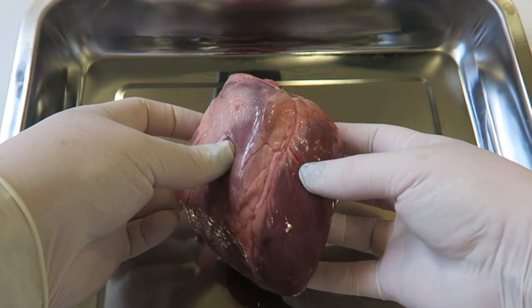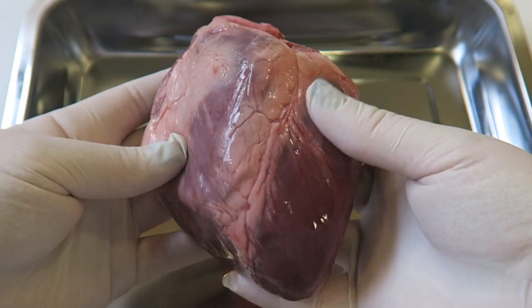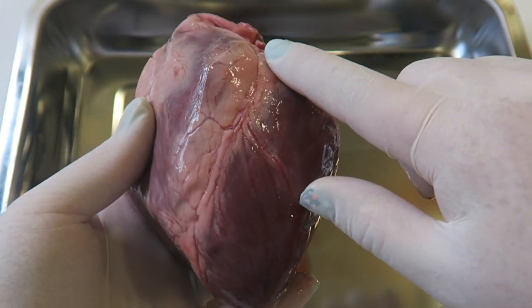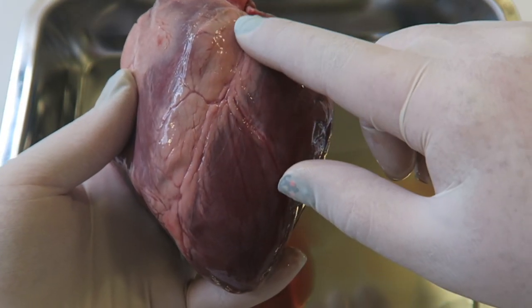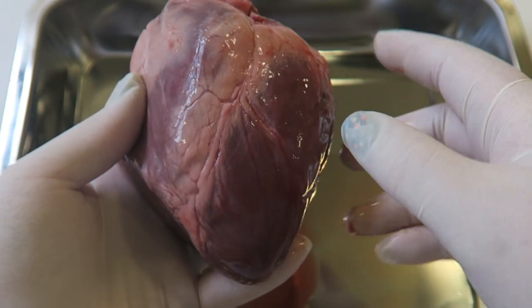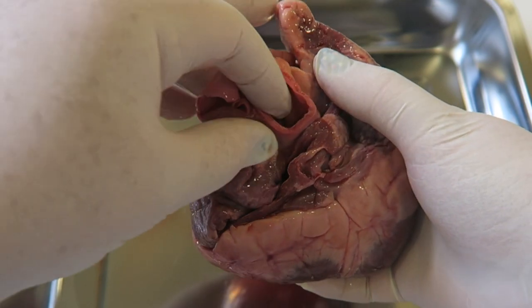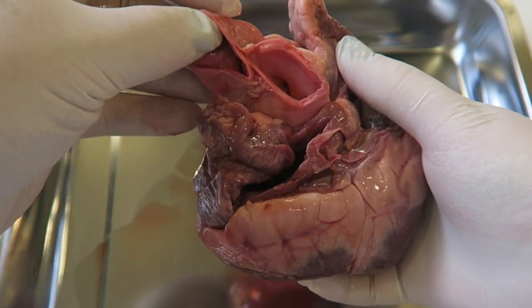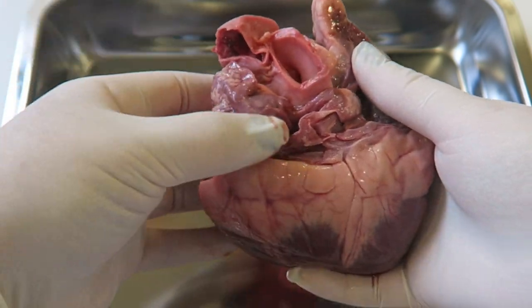All right, so here we have our heart. This is the right side, this is the left side. This is the coronary artery going down here. We open it up, we can see some vessels. You can see this quite large, wide one here, and this slightly thinner-walled one here.